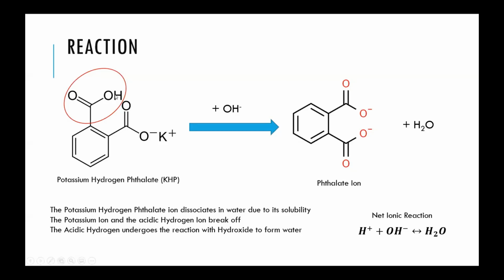All of them are kind of pulling that one lone electron from the bond towards these oxygens, so the hydrogen can easily leave. That's the whole basis and reactivity of carboxylic acids, is that this hydrogen can relatively easily fall off.